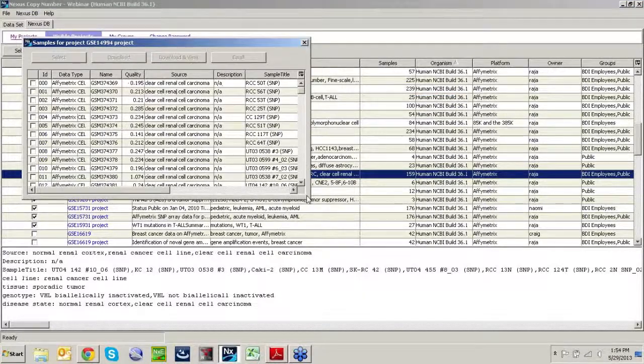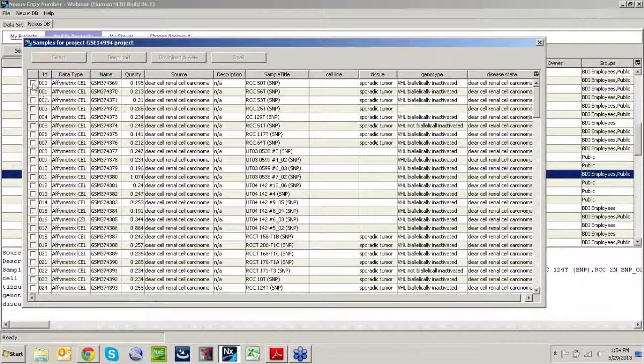And now it's going to show us all of the samples within that project, any factors that may be associated with it. And we just simply click on these buttons here to download the ones that we're interested in. This really is a nice way for us to share the publicly available information that's housed in a lot of different places, for example, the GEO datasets or TCGA data. And as you can see here, if you want to view anything, you can just go ahead and do it.